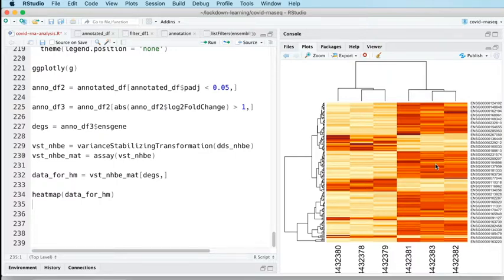This data is also scaled by row, which for this kind of data is fine, so you can always see which side is low and which side is high. Although, because I don't have a key, I'm not actually sure which. I think the reds are the cooler colours and the yellows and whites are the hotter colours, so these will be higher numbers and these will be lower numbers, but without a key, I can't be sure about that.